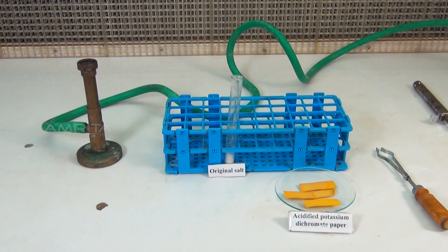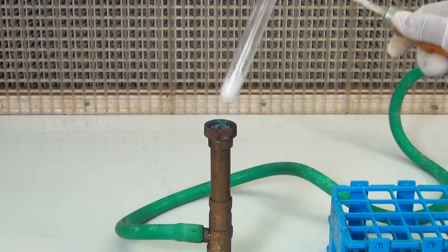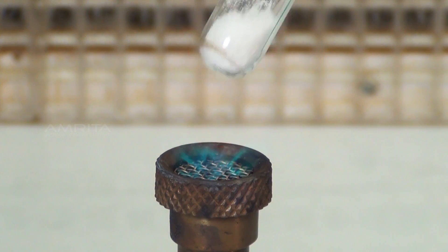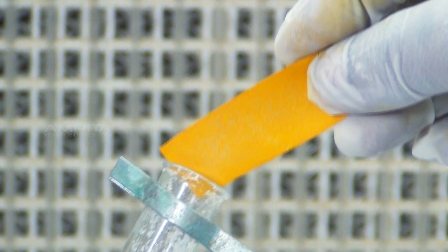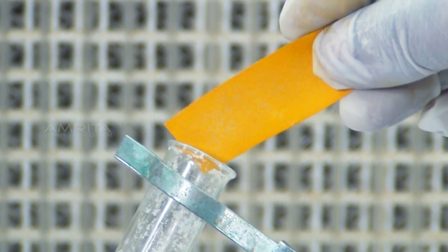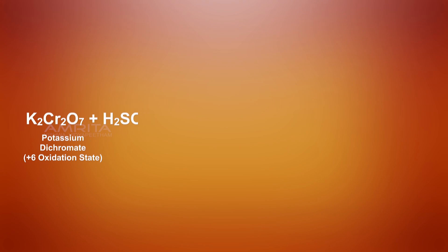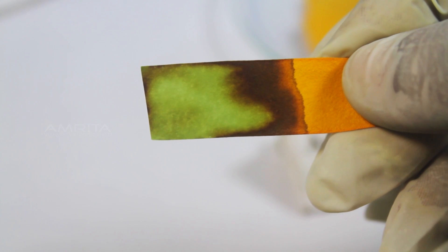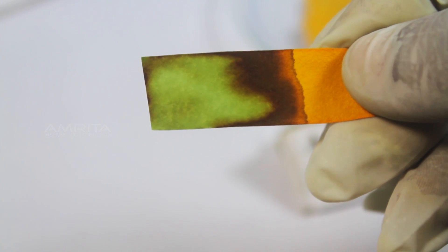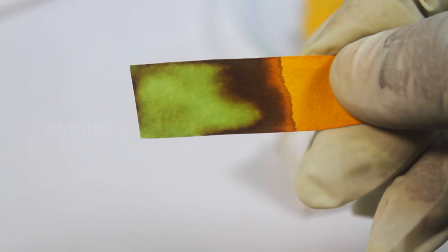Procedure: Take a small quantity of the salt in the test tube and heat it over the Bunsen burner. On heating, sulphite undergoes decomposition to evolve colourless sulphur dioxide gas with a characteristic suffocating smell. Place an acidified potassium dichromate paper over the mouth of the test tube. In the presence of acid, sulphur dioxide reduces chromium in potassium dichromate from +6 to +3 oxidation state. Chromium in the +3 oxidation state gives green colour to the acidified potassium dichromate paper.